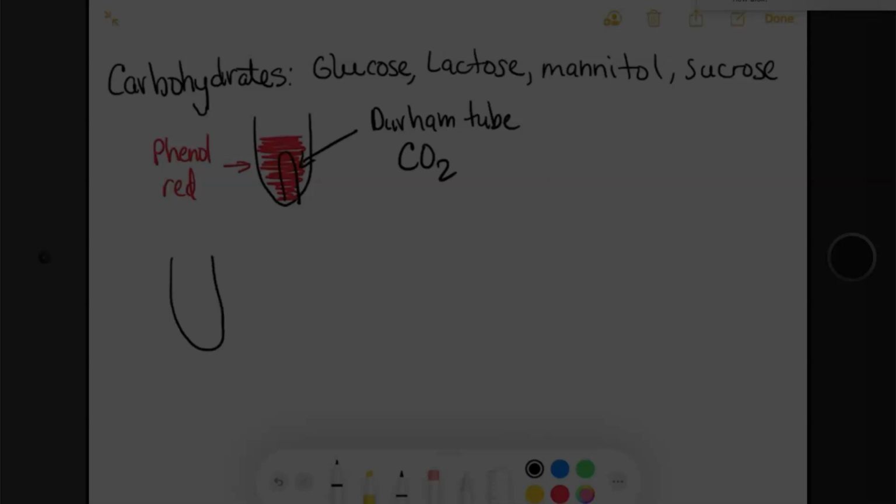And so what are the experimental results that we would expect? Let's take a look. One of the potential results would be that after inoculation and incubation, your media looks the same. What happened? Well, basically nothing. You see that your media is still at a neutral pH because your bacteria did not ferment the sugar. Therefore, this result would be negative. Another potential experimental result would be as follows.